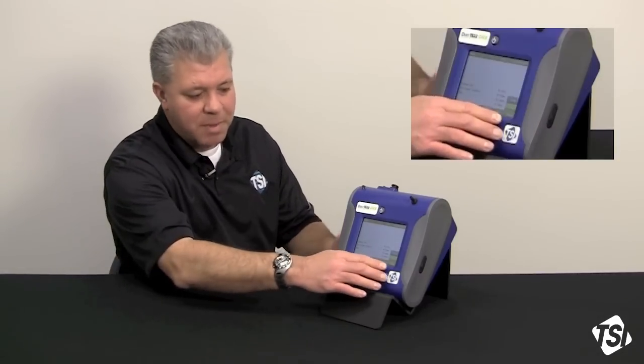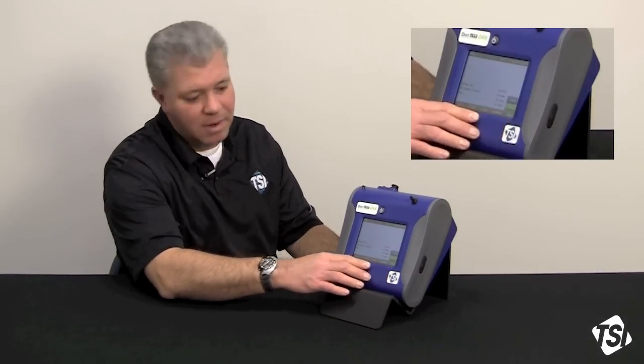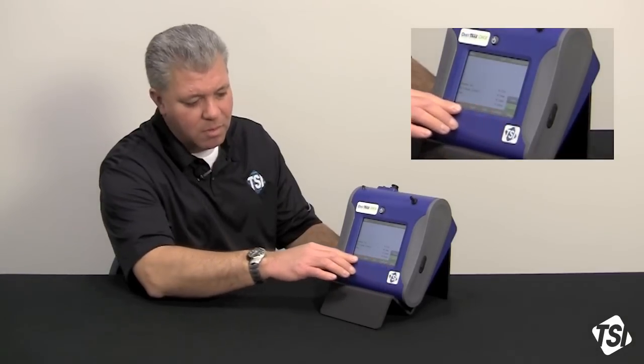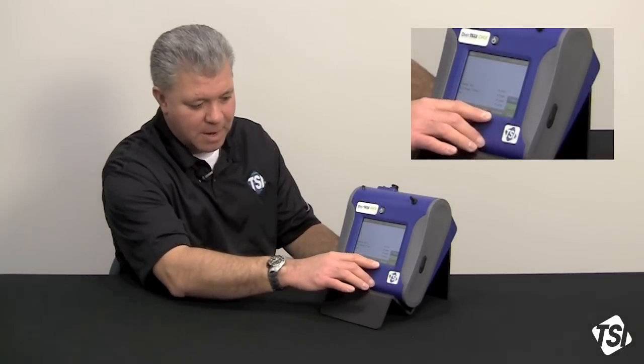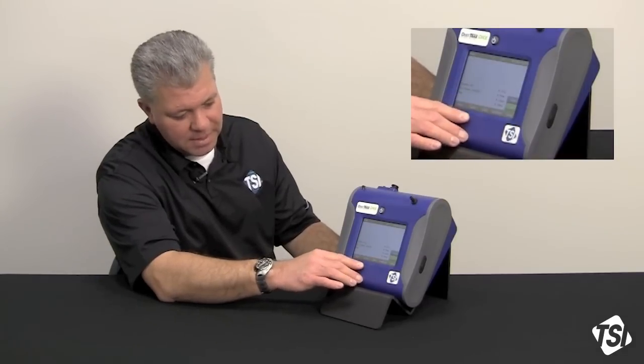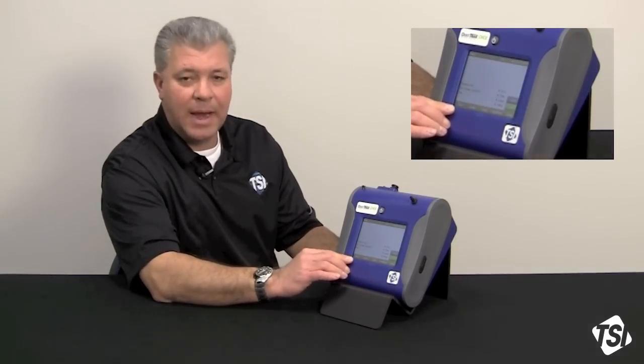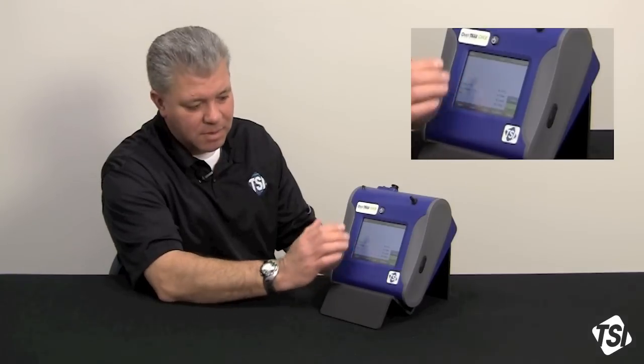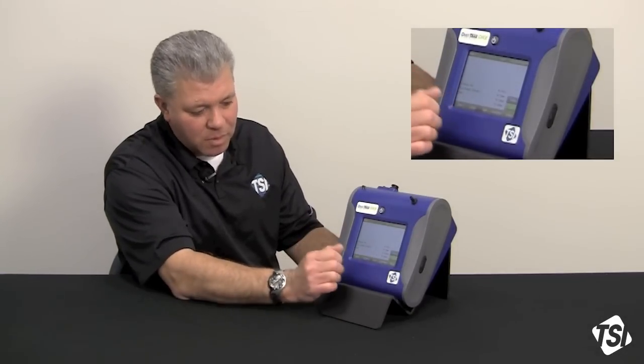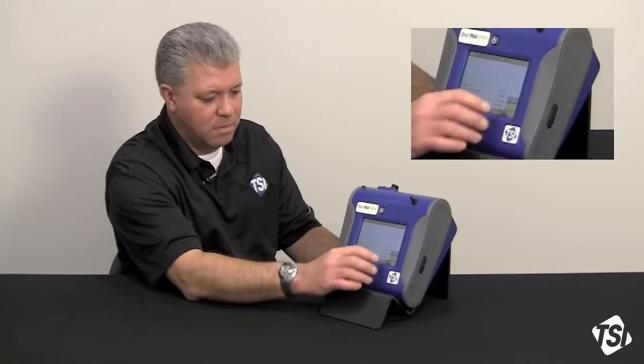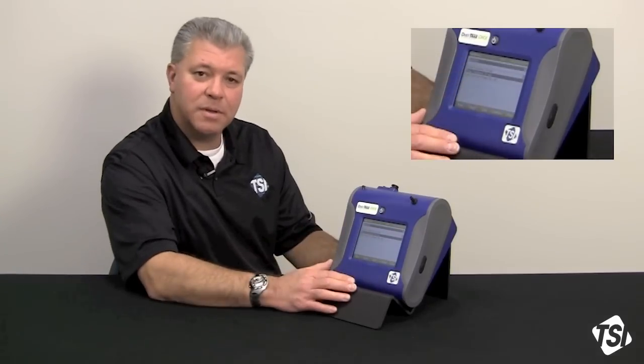Now, across the bottom of a DustTrak 2 or DRX, you have a row of function tabs. You've got the setup tab, the run mode tab, the data tab, the graph tab, and a main tab. We're in the main screen right now, which was actuated by the main tab. What we're going to do is go over to the run mode tab, and I'm going to select that.